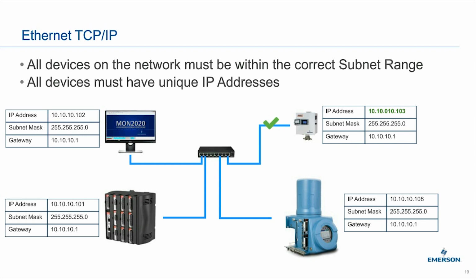I got a good question here about OPC. You can use OPC, but what we tend to do with OPC is we'll have an OPC server sitting on a computer, a standalone server, or on a customer-supplied server. The OPC server will talk to the GC using Ethernet Modbus, and then the actual OPC communication occurs between the server and the host device.